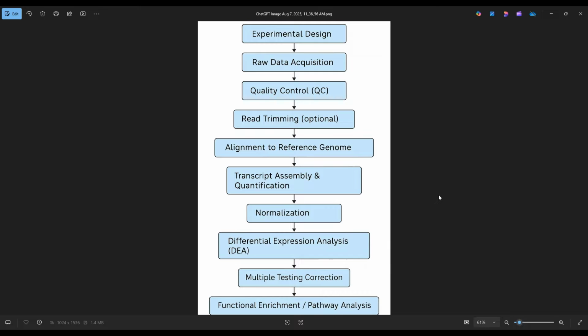Today's tutorial is a very interesting tutorial for a lot of biologists, biology students and research students. I have thought about it a lot because there are a lot of things present in different patches in my YouTube channel, in other YouTube channels, and in a lot of tutorials on how to do RNA-Seq data analysis, whole genome sequencing data analysis, and other analysis.